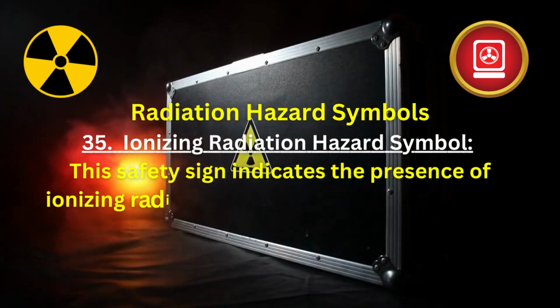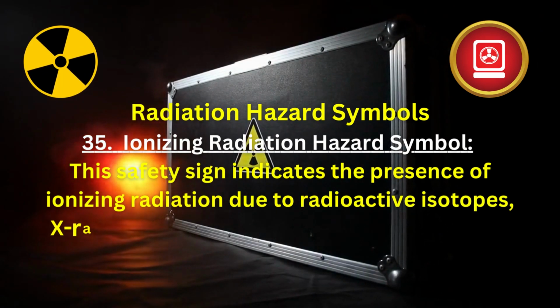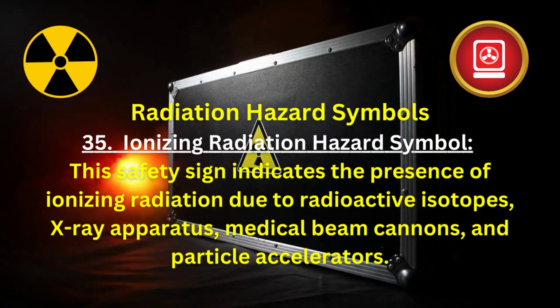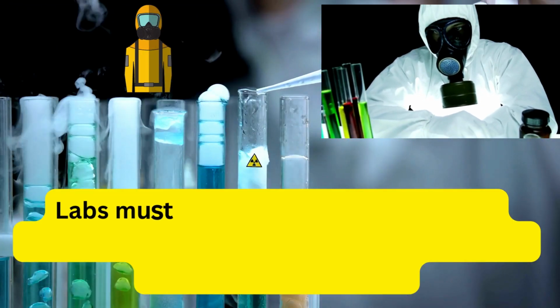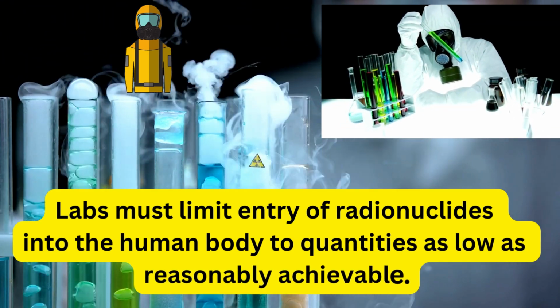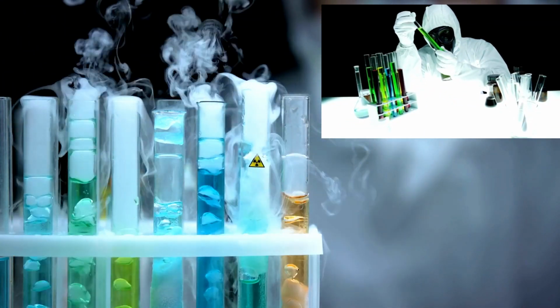This safety sign indicates the presence of ionizing radiation due to radioactive isotopes, X-ray apparatus, medical beam cannons, and particle accelerators. Labs must limit entry of radionuclides into the human body to quantities as low as reasonably achievable.